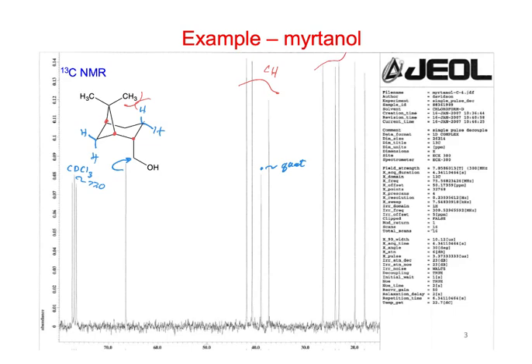They're going to be somewhere up in here, along with three CH2s. So those upfield ones have to be the CH3s and the CH2s. CHs are more downfield because of substitution, both in proton NMR and in C13: as they become more substituted, they tend to move further downfield.